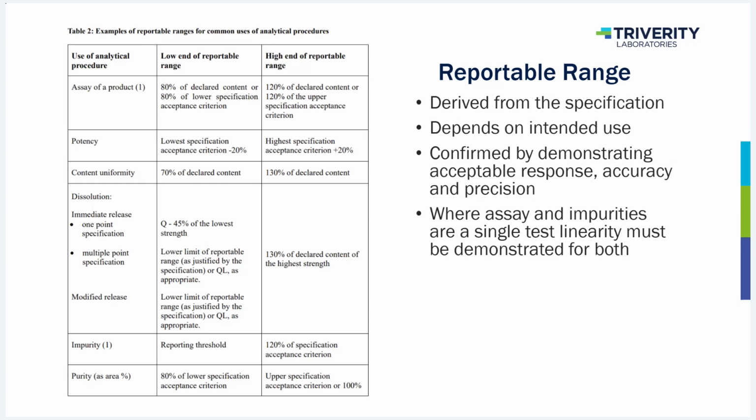When you are in product development, method development, you have limited knowledge. And if you have a degradant that you see growing, you set a specification based on where you think it's going to be. It could be different. Going back and revalidating a method is really not something you want to do, especially for extending the range of an impurity or two. So if it's a degradant, I would probably go wider than 120% of the specification, because it doesn't really matter.